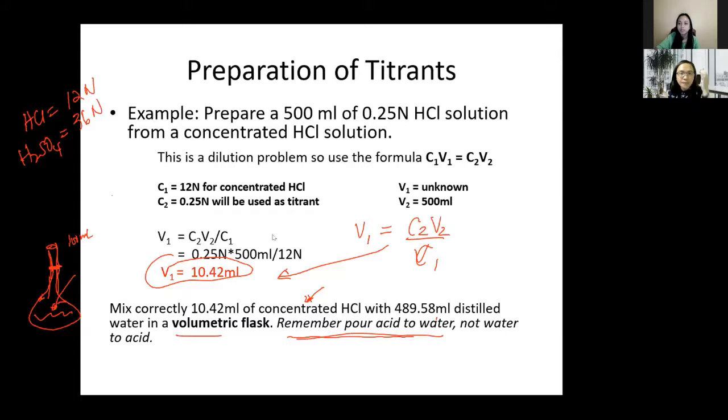Ang mangyayari is that magkakaroon ng fumes. The hydrochloric acid, magiging gas yung ating hydrogen chloride. So, pag gano'n ang mangyari, magkakaroon ngayon ng less concentration ng hydrochloric acid kaya nahimo man siyang gas ng uban. So kung nahimo na siyang gas, mabawasan na siya ang imuhang concentration. Okay, nag-evaporate naman itong uban na gas. In that case, dili na ito makuha ang atong right concentration during the preparation.